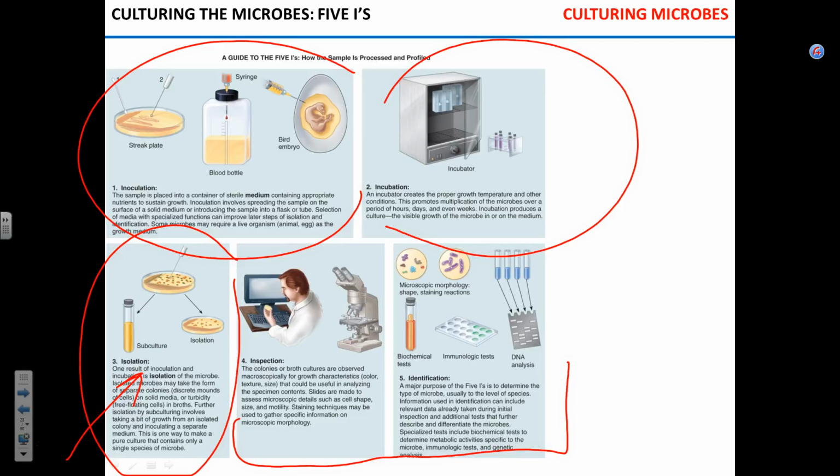And what I want to do next, it would be great if you would get a little notebook and just write down the results, because when you sample the environment and you grow something on your plate, you're going to select the colony and you're going to study it throughout the semester. Does that make sense? So you're going to grow your microbe, one microbe. You don't know what it is, but you're going to work on it, okay?